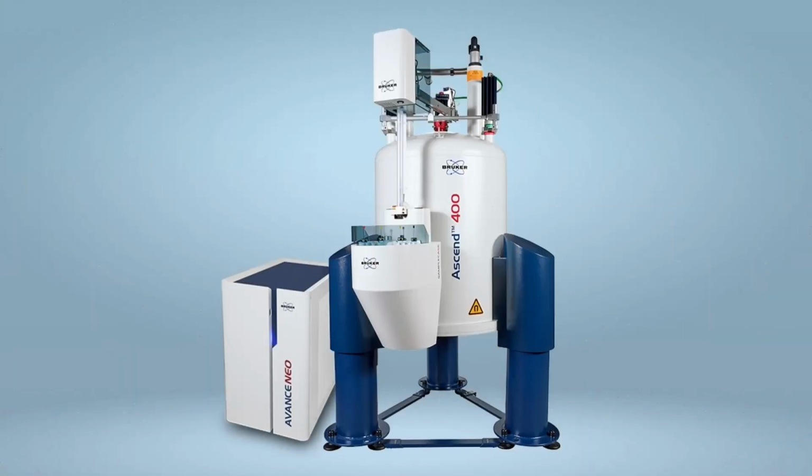This picture shows a typical NMR instrument. The fat cylinder is a supercooled magnet. The device hanging over it is an automatic sample changer, and the console in the foreground controls the machine. NMR machines contain very strong electromagnets.